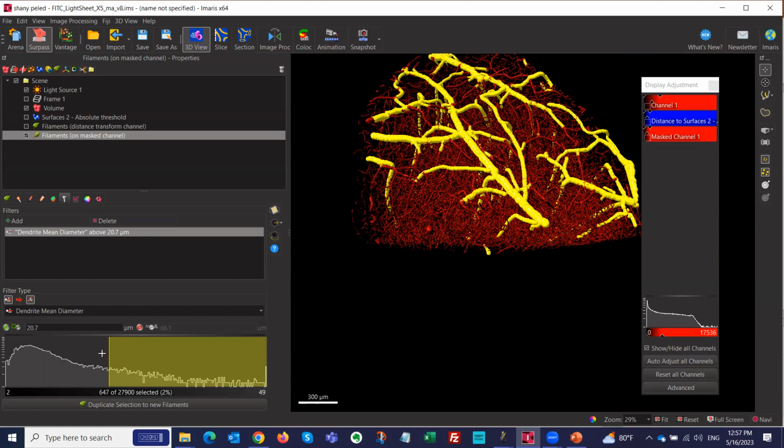I mean, this is the end. I didn't cover obviously everything that Imaris has to offer. This is an overview of what I wanted to share with you, especially about the new version and the general overview for those of you who've never used Imaris before. Hopefully, I'll see some of you in the one-on-one sessions. We can talk about your specific data individually in more detail.